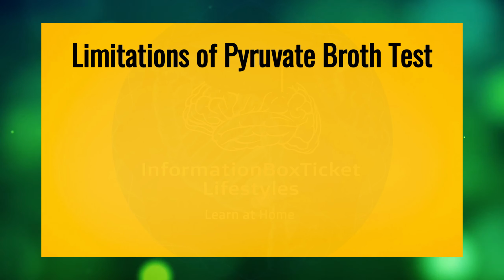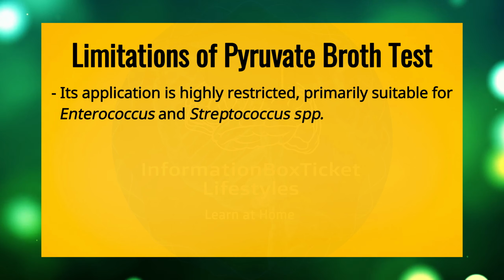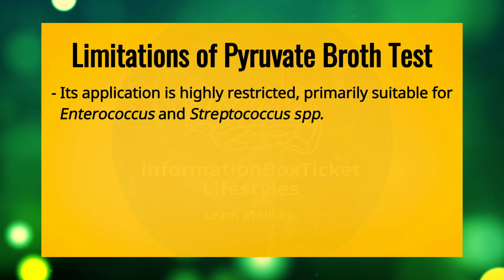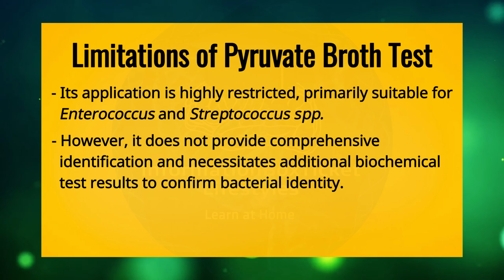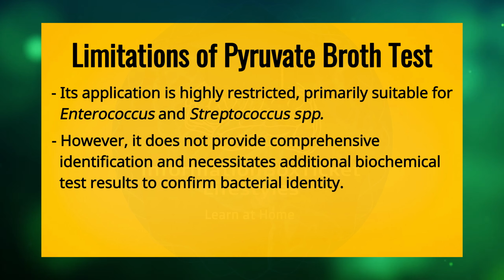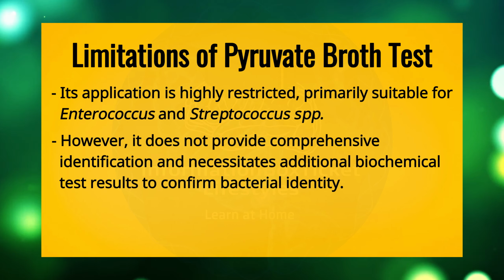Limitations of Pyruvate Broth Test. Its application is highly restricted, primarily suitable for Enterococcus and Streptococcus spp. However, it does not provide comprehensive identification and necessitates additional biochemical test results to confirm bacterial identity.